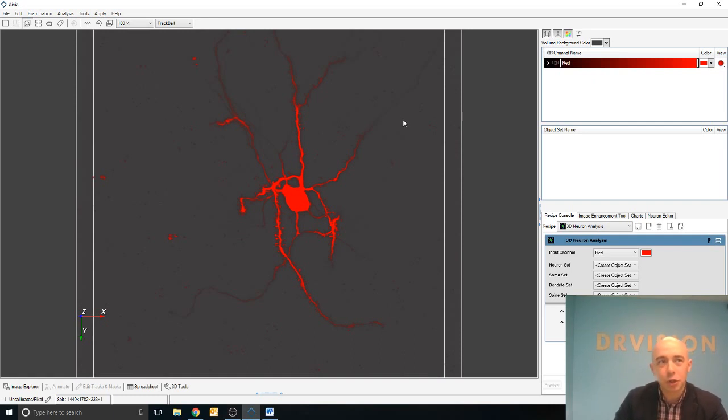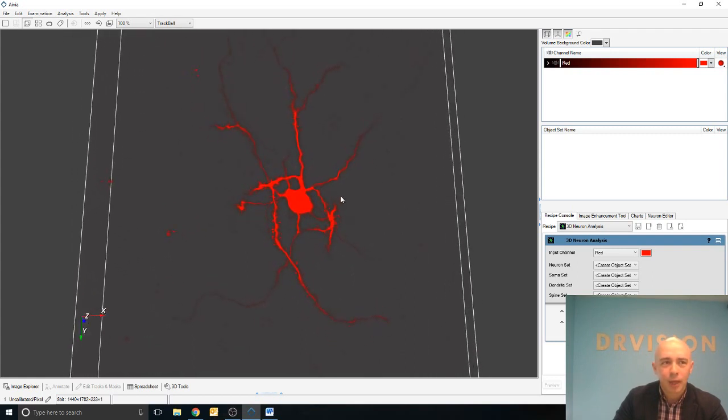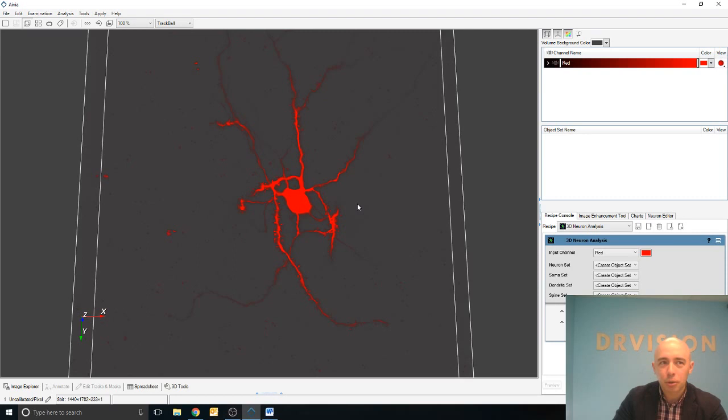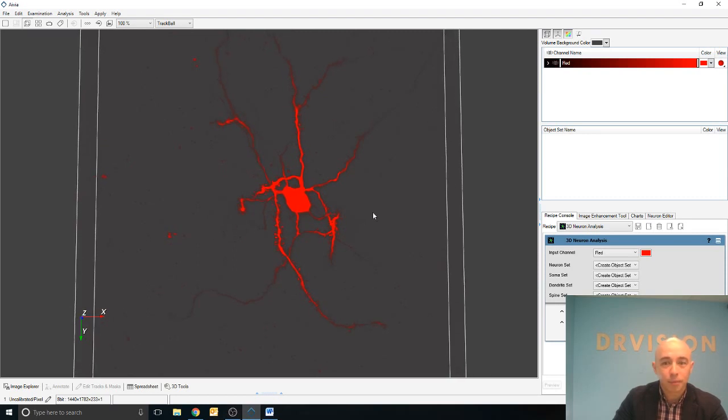There are some additional features to be considered when viewing images in 3D. Features beyond what we have discussed in 2D so far. The most interesting of these is perhaps the different rendering modes, which is how we interpret data from each slice in a Z-stack. Here we have started off with a volume rendering. This interprets each bright intensity as the volume of the cell.